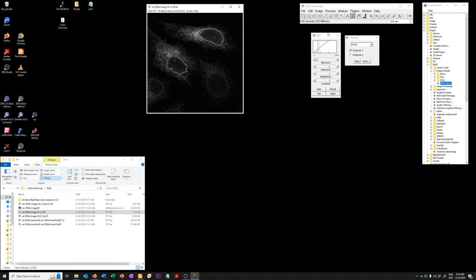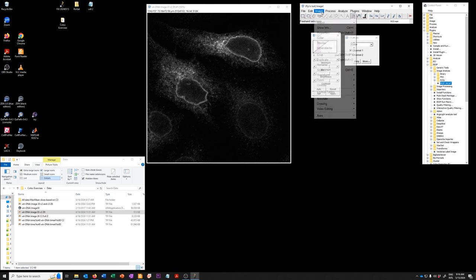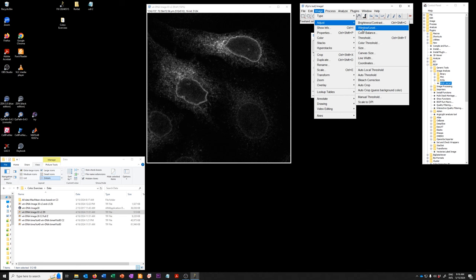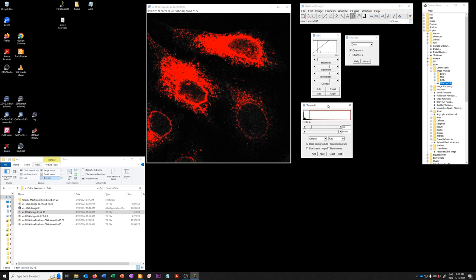So there are multiple ways of exploring appropriate thresholding methods and appropriate thresholds in Fiji. I'm going to show you two of them. The first is to open image adjust threshold. This opens this little window here. You want to make sure that dark background is checked and nothing else is checked when you do these exercises.